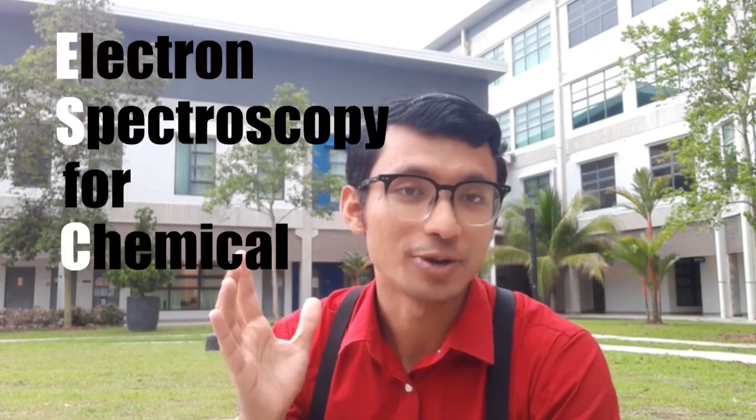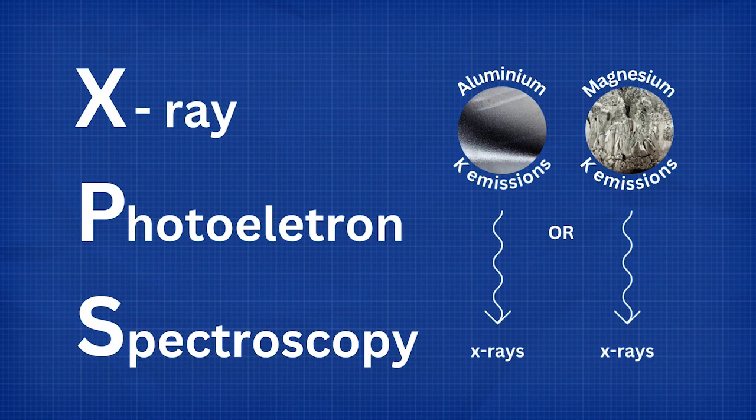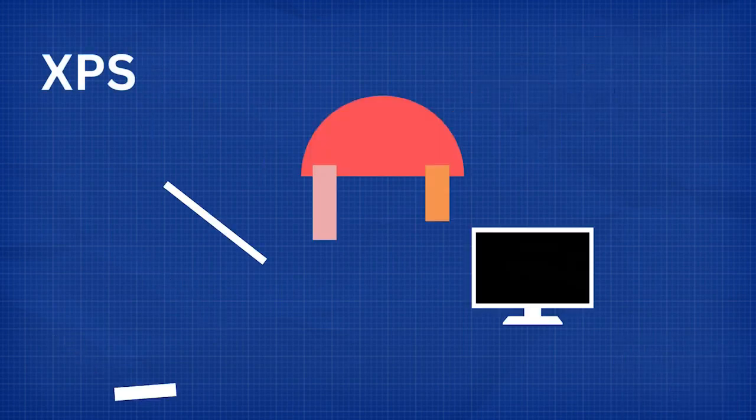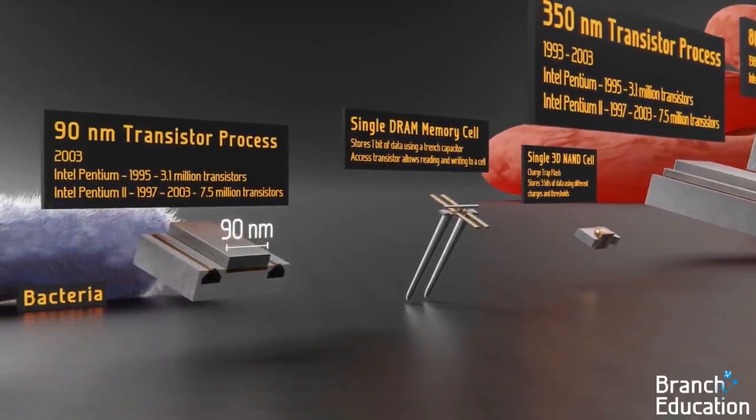It wasn't until 1957 that Siegbahn's prototype began operations. This became the foundation for his paper on electron spectroscopy for chemical analysis. So, what is XPS exactly? It's a surface-sensitive and non-destructive technique of analyzing the outermost layer of atomic structures. Usually for layers as thick as 10 nanometers, the instrument sends X-ray photons towards a target material, allowing one to observe the energized surface electrons' behavior as well as properties.